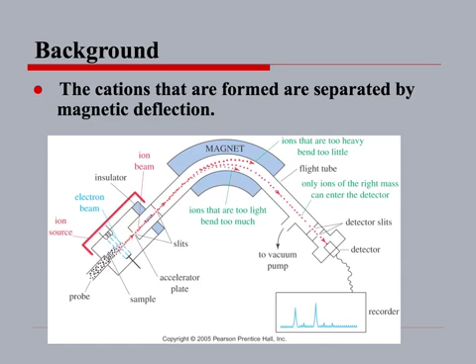So you can detect the various fragments from there, and some of these molecules will be the original molecule which entered here and just had a charge, so it will be the largest molecule in the mixture of the fragments. Okay, so let's continue.